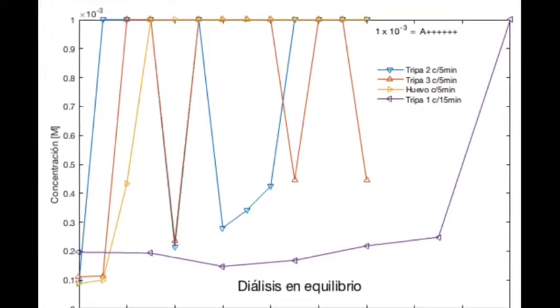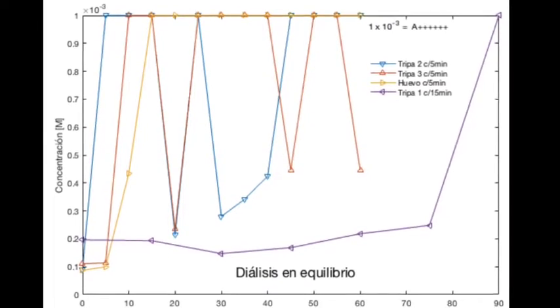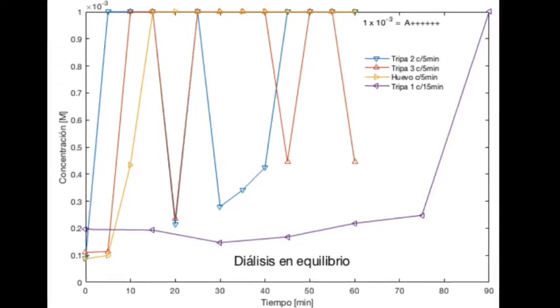This part of the experiment was pretty time consuming and honestly quite boring. After measuring the samples, we found that we did not have reproducible data in our results. The membranes did not block the proteins from going from one side to the other and interfered with the reading in the spectrophotometer, giving us a concentration above the limits of the wavelength.